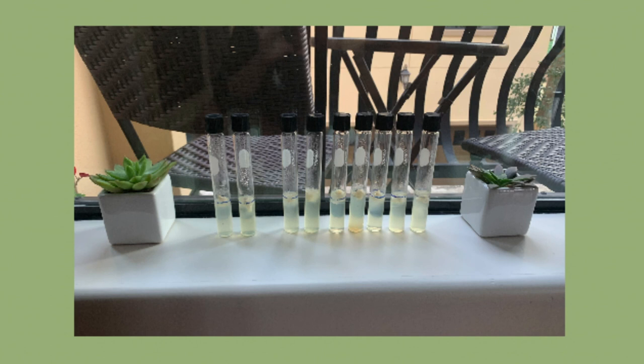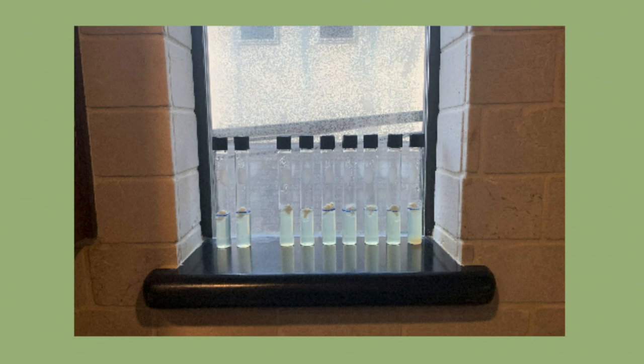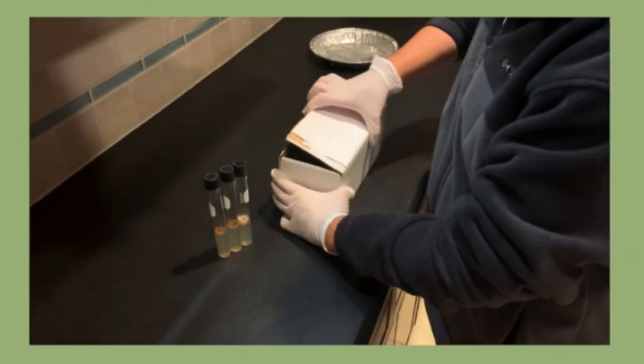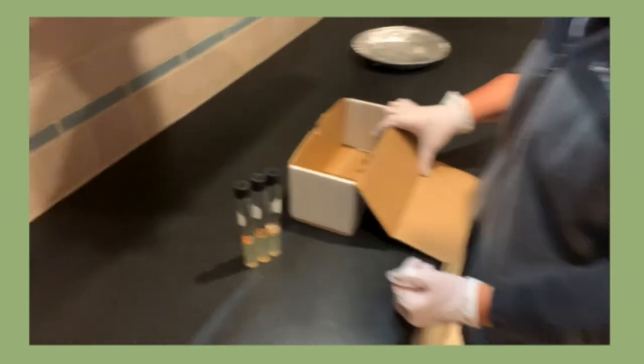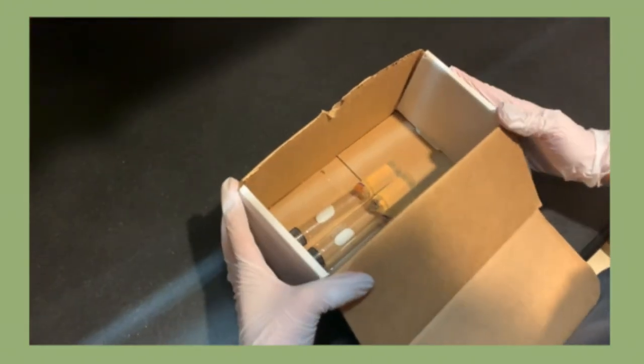Place the tubes on a windowsill, where they will receive indirect sunlight for most of the day. Root should appear within 6 weeks. Contamination for some of the plants is likely. If some of the plants become contaminated, as can be seen here, remove the test tube from the bunch and place into a cardboard box. Once sealed with tape, that box can be discarded into the trash.